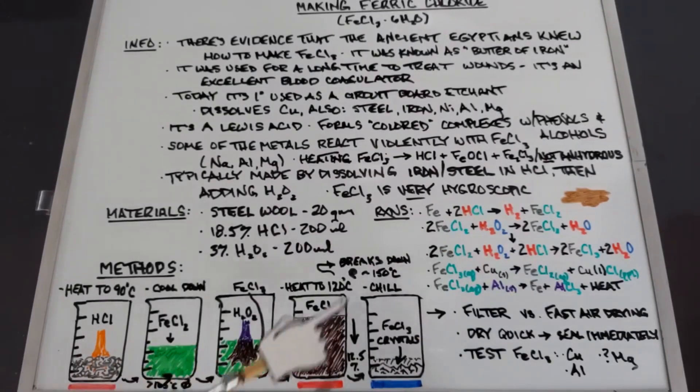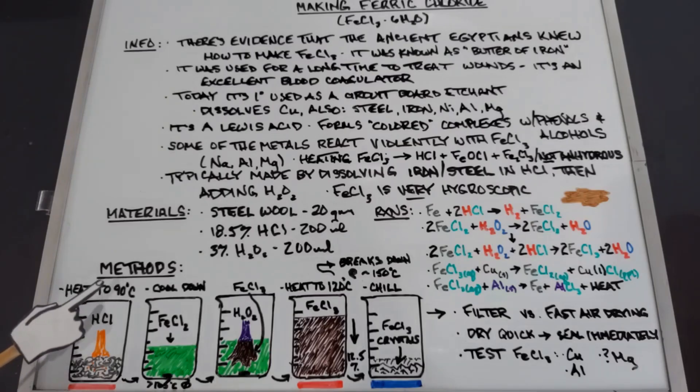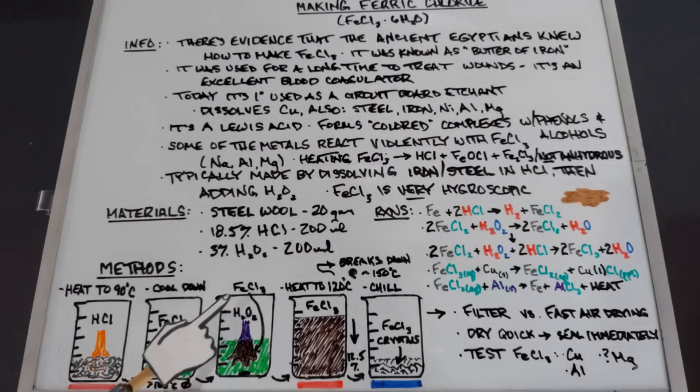In our method: we start with steel wool on the bottom of the beaker, add hydrochloric acid, and can heat this up to 90°C — ferrous chloride doesn't break down until 105°C. We heat it to help dissolve the steel wool, keeping it no more than about 90°C. Then we need to let it cool down before adding hydrogen peroxide.